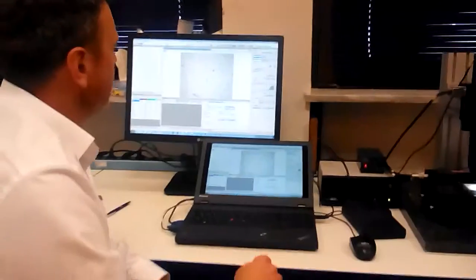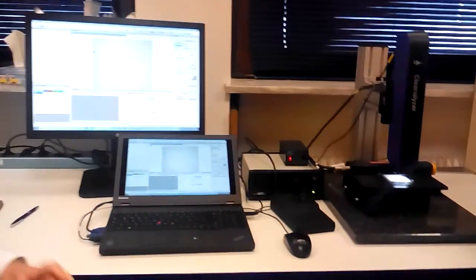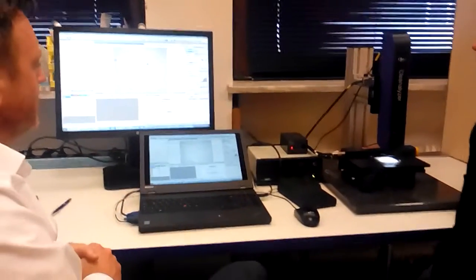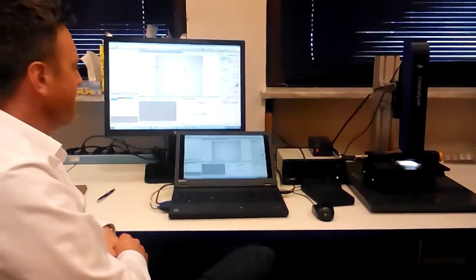So into the software, I will need help from my colleague Ms. Eman here. The software is designed to be really quite powerful. It allows a user to create their own standards of cleanliness or to be compliant with some of the industry standard specifications.